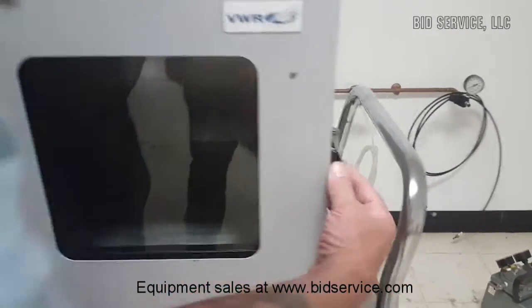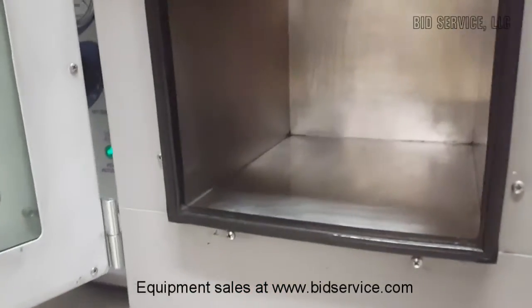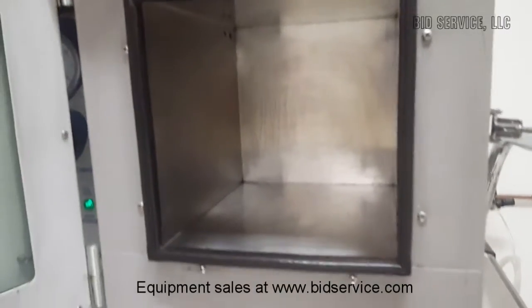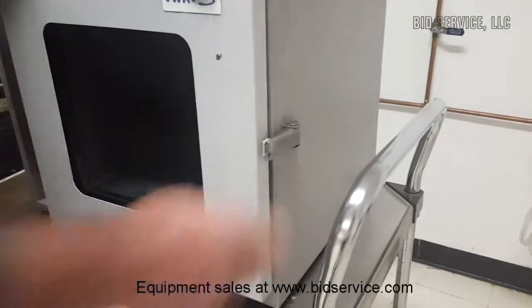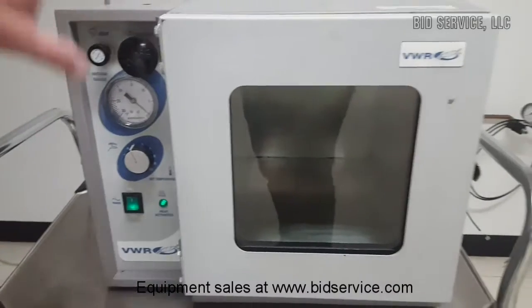Before we go too much further, I'm going to open up the oven so you can see the interior. It just latches like that. We're going to let this heat up, and I'll have an external meter hooked up so you can see the temperature.